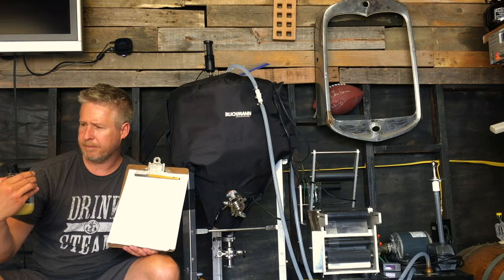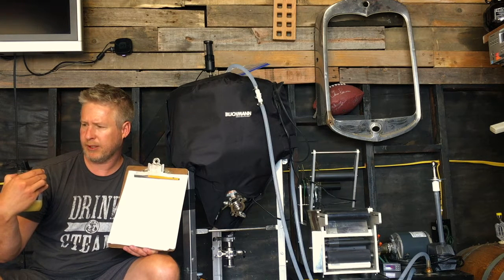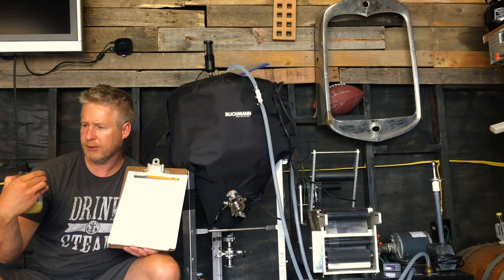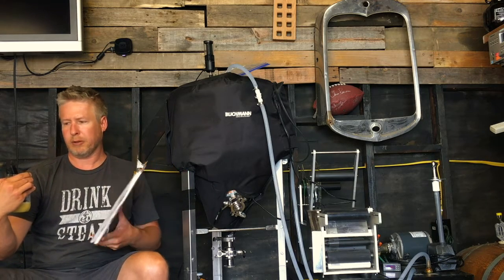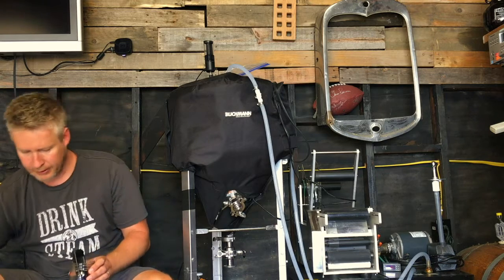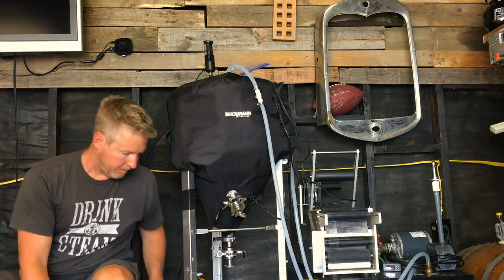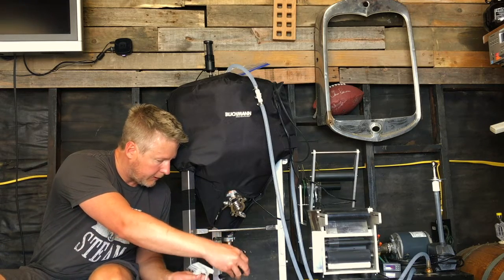So we've got a rough pH here of 4.66, it looks like, at 60 degrees. That'll probably continue to fall a little bit. But now that we've degassed, we've taken our pH reading. Get this guy cleaned up real quick.